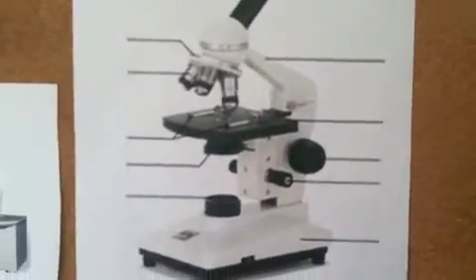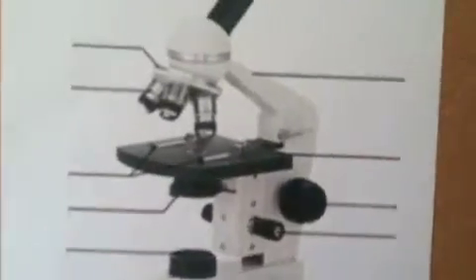Next is the stage, which supports the slide being viewed, and the stage clips, which hold the slide in place in order to see.